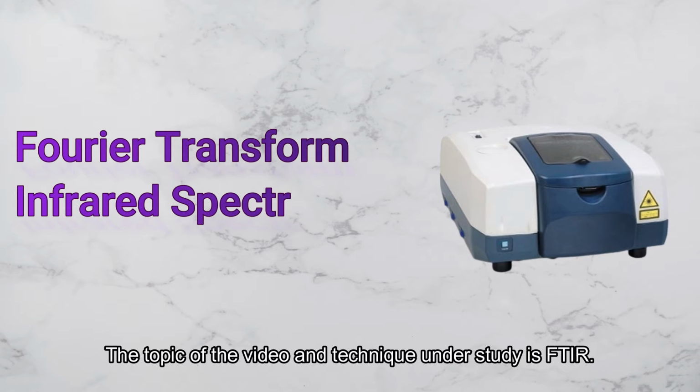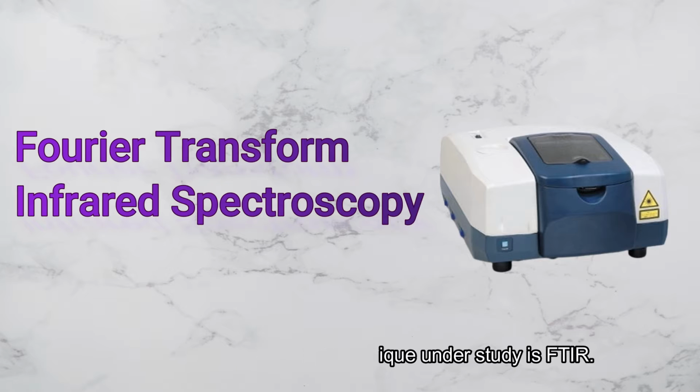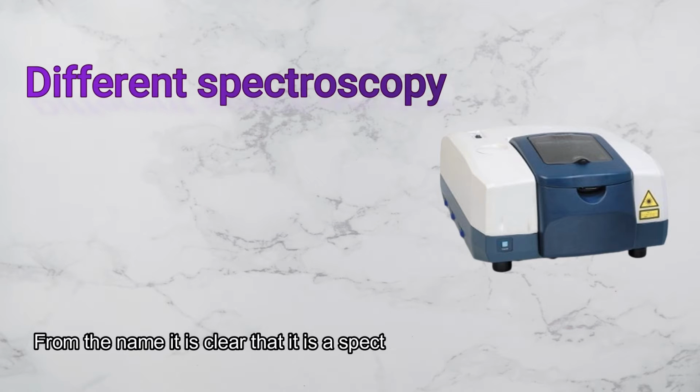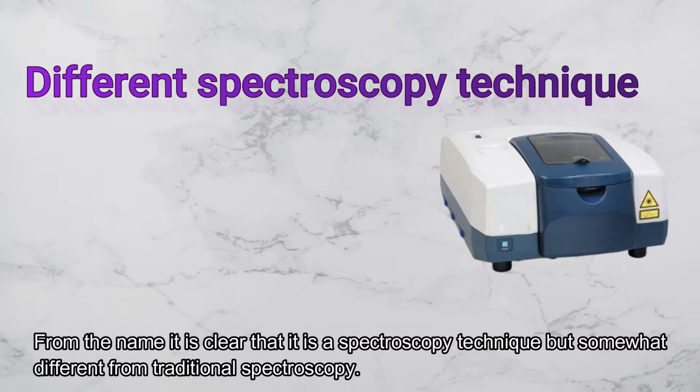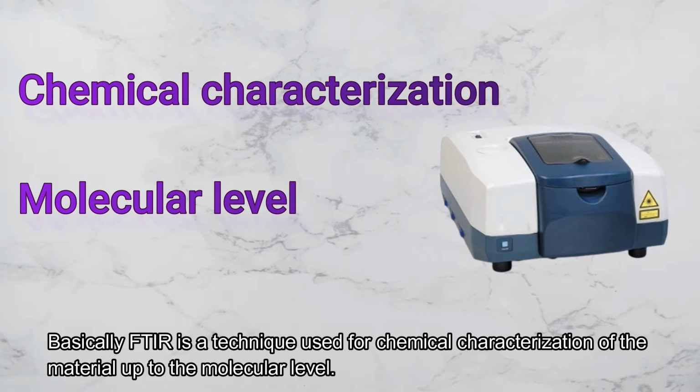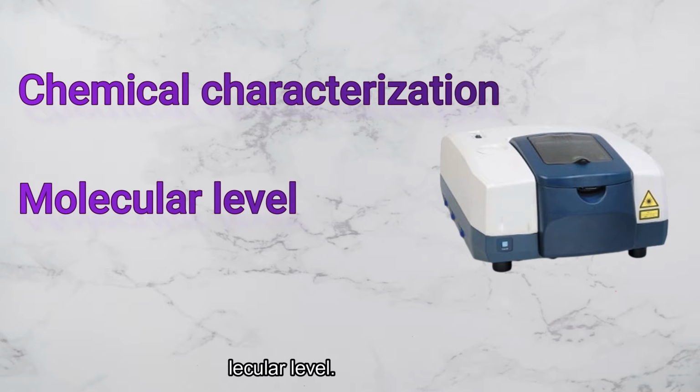The topic of the video and technique under study is FTIR. Its name is abbreviated from Fourier Transform Infrared Spectroscopy. From the name, it is clear that it is a spectroscopic technique, but somewhat different from traditional spectroscopy. Basically, FTIR is a technique used for chemical characterization of materials up to the molecular level.